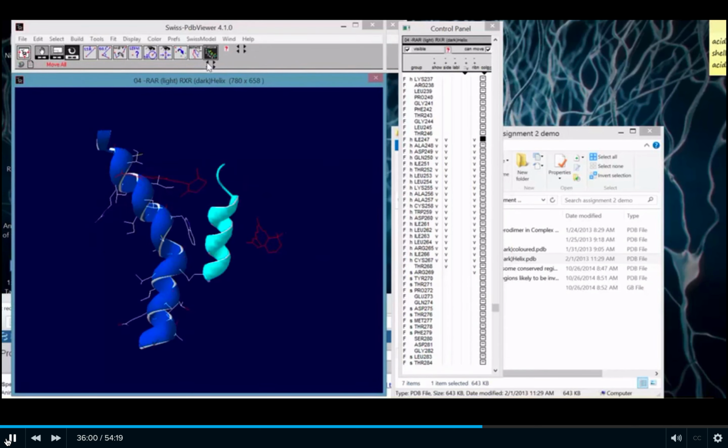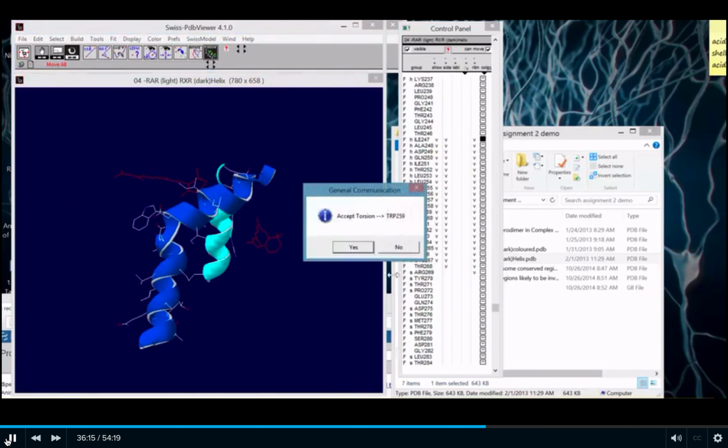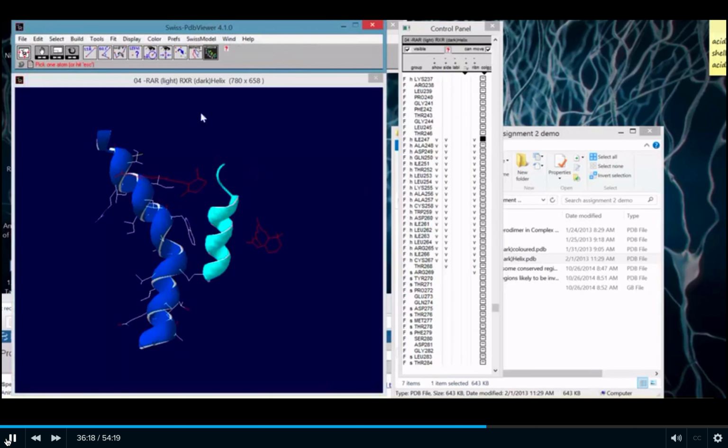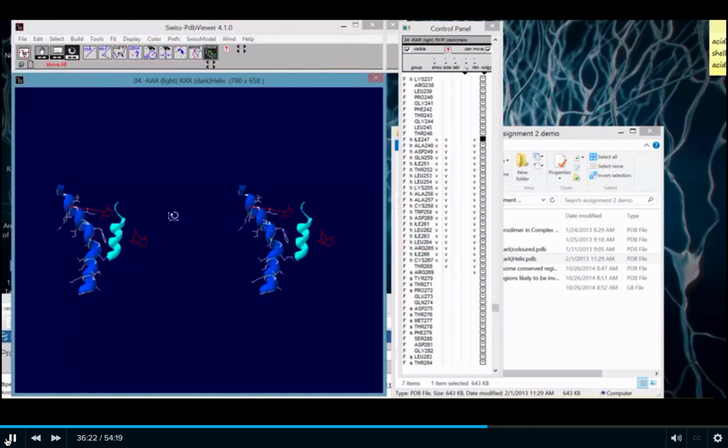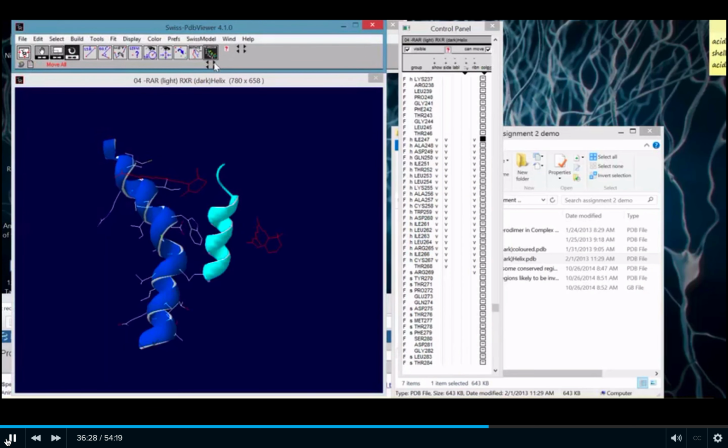So these are a little tricky to click, but if you can get them, I can then rotate these around very nicely. Oh, that's quite quick. I'm obviously not going to go crazy with it like that, but if my original protein was like this, I could go in and just very gently tweak it a little bit. I've only made one residue change, so you're not making a huge impact, but I could tweak it, say like that much, and then maybe it bends that much.